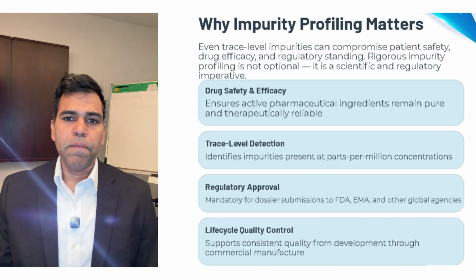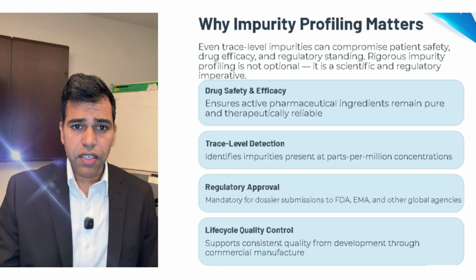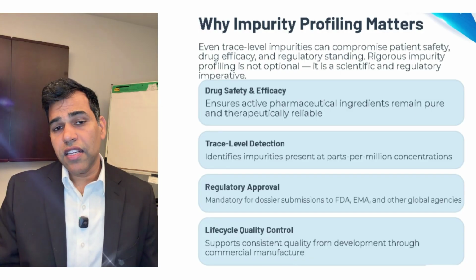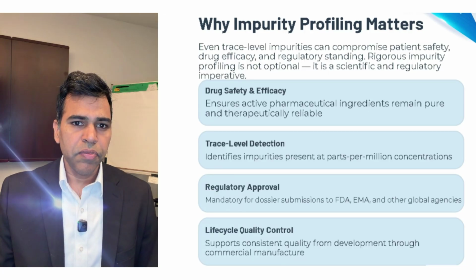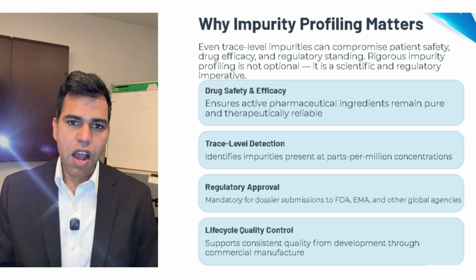And here is the thing, impurity profiling isn't just a one-time event at the development stage. It follows the molecule throughout its entire life cycle, from early synthesis right through to commercial manufacturing. The bar doesn't drop, it gets higher and higher.